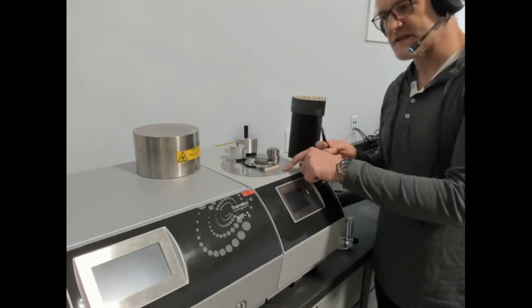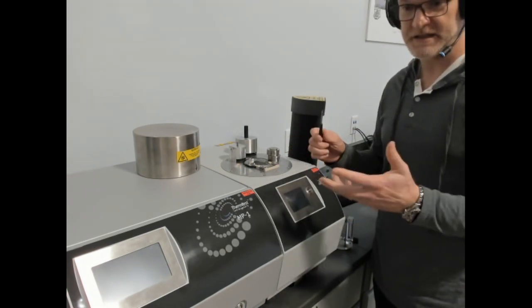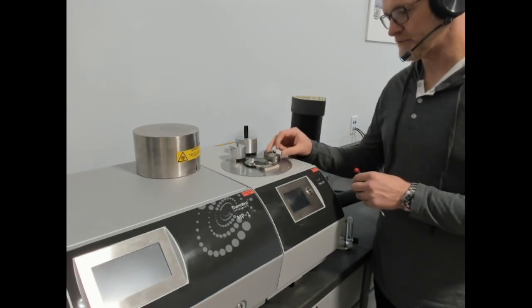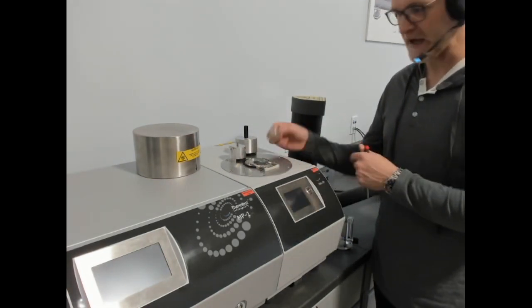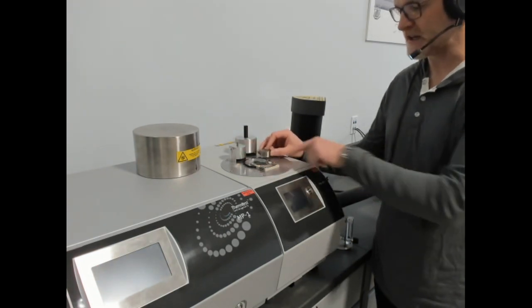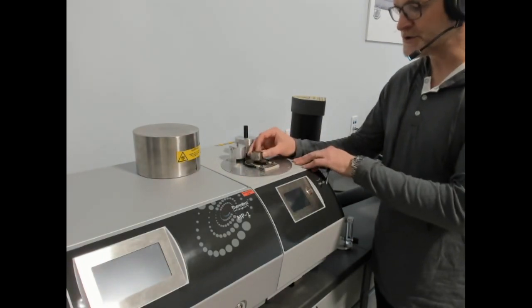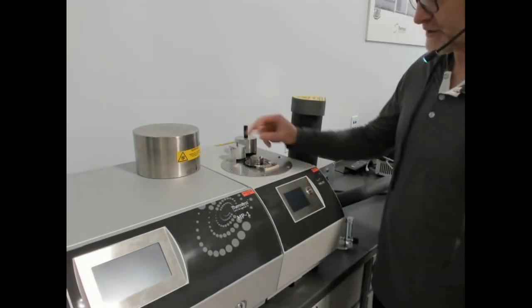If your samples are larger than this, we have our standard room temperature sample holder that can go up to 300 Celsius, which is 4-inch square by 2-inch. You can use that if your samples are larger than this, but we find this accommodates most R&D development materials. If you're running symmetric, you place one sample half on the bottom and one on top. In this case, we're measuring stainless steel. If you were running asymmetric or single-sided, you would introduce a known material, which we provide with the instrument, on the bottom or top, and then you would introduce your unknown material to the other side. So your sandwich would be known material and your unknown material on the other side.